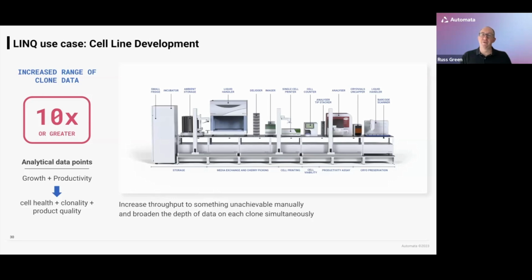So here we see a system that we've unfolded. I have made this very linear. That has a lot of the capabilities built into it for a very end-to-end cell line development process. So we see those core capabilities of liquid handling and incubation and cell counting on this platform. So now we have the Beckman Coulter Vicell integrated. But we've then started adding in some other capabilities.